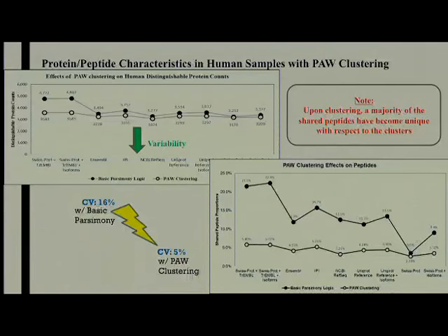How long were your peptides? Was there a minimum? Seven and above. The minimum size of a peptide is seven amino acids. And so theoretically, these peptides were just random slices out of the full length of your protein. Not really random. There's an arginine or lysine residue. Okay, because of the trypsin digestion. Yeah, exactly. That's right.